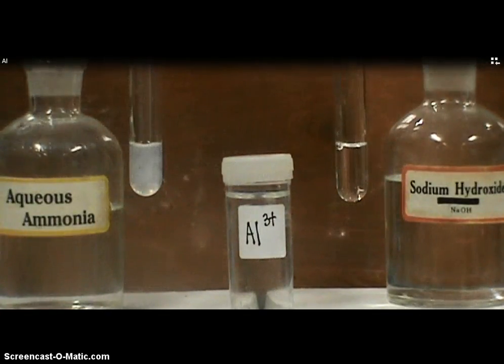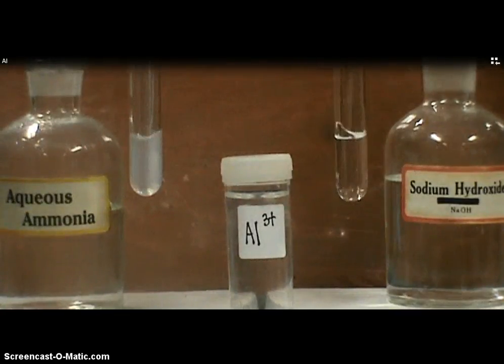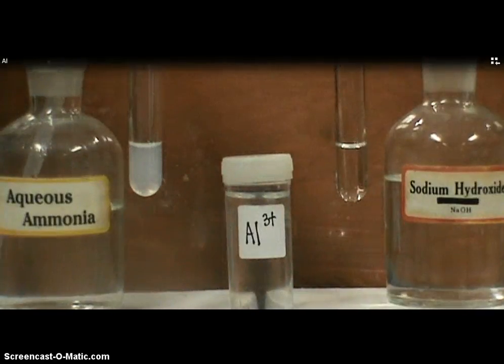On addition of an excess of the alkaline, the white precipitate dissolves in an excess of aqueous sodium hydroxide, forming a colorless solution, but the white precipitate remains insoluble in an excess of aqueous ammonia.